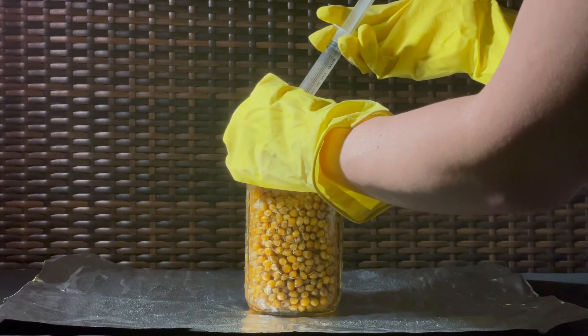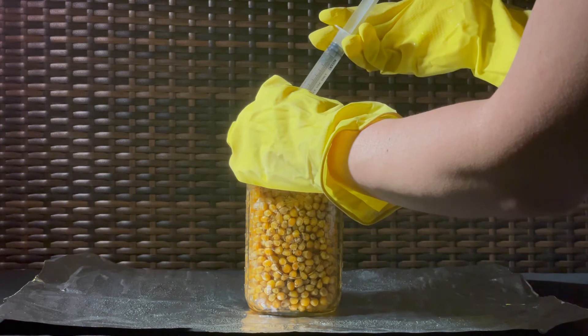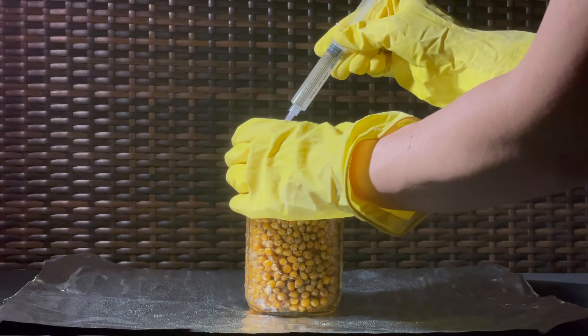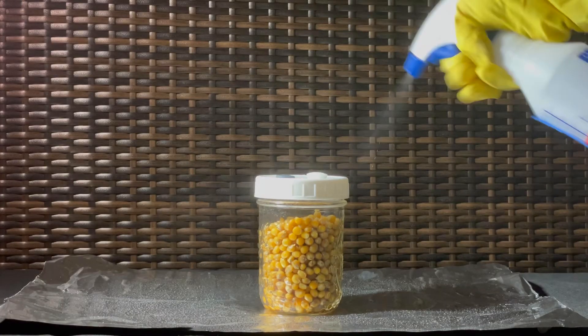Inserting at an angle and aiming at the side of the jar is also helpful. You'll start to notice growth on that side of the jar in just a few days. Repeat these steps for each of your jars.